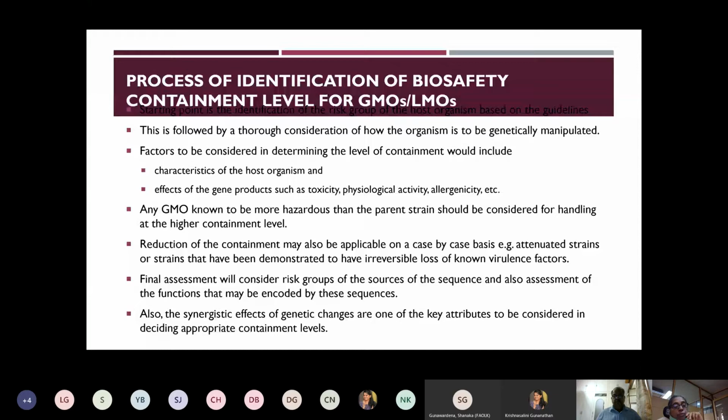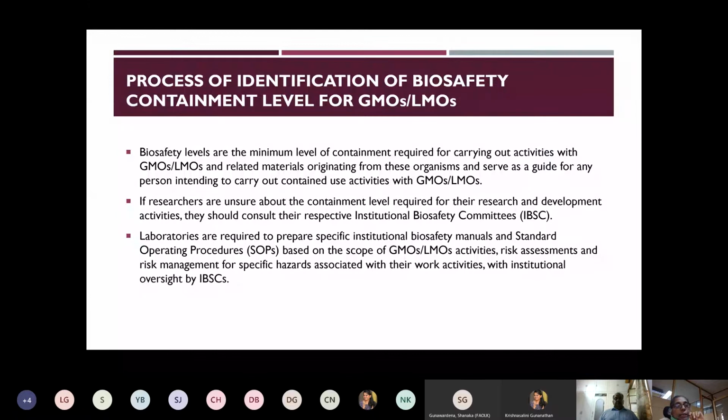So we have the levels for organisms, and when we are doing it for GMOs or LMOs, this is the process that we have to follow. Now, biosafety levels, whenever they are defined, are the minimum level of containment, and they serve as a guide for carrying out the contained use activity. If you feel you can have additional precautions or anything, nobody stops you from doing that. But this is the minimum which has to be maintained.